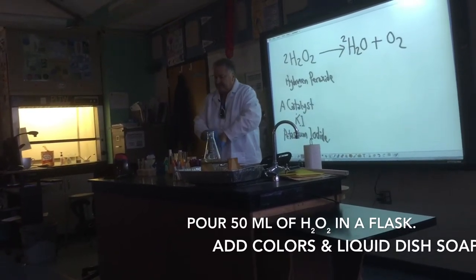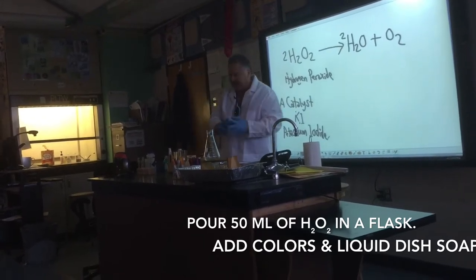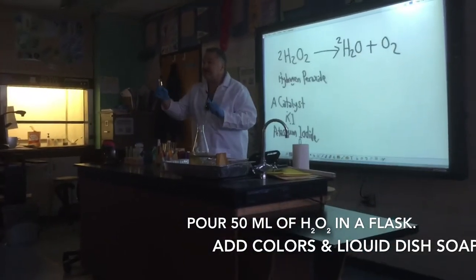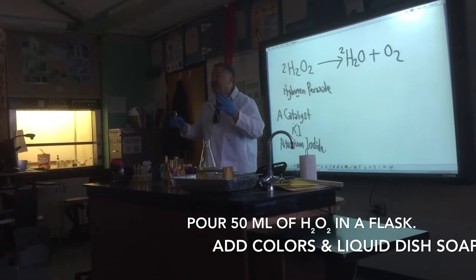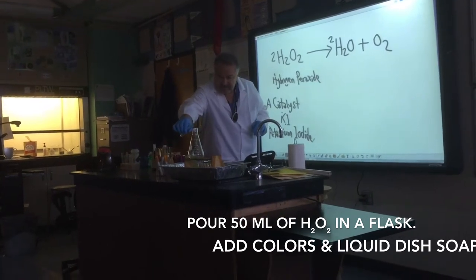Now, again, I apologize. If you want to speak, please use your hand. Okay, here's the hydrogen peroxide. What's the percentage? 30. That is how many times more powerful than the one in the store? 10 times. That's a lot more powerful. So, carefully, I'm going to pour it over here.